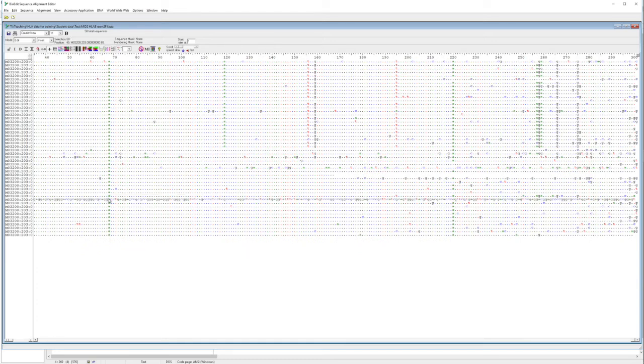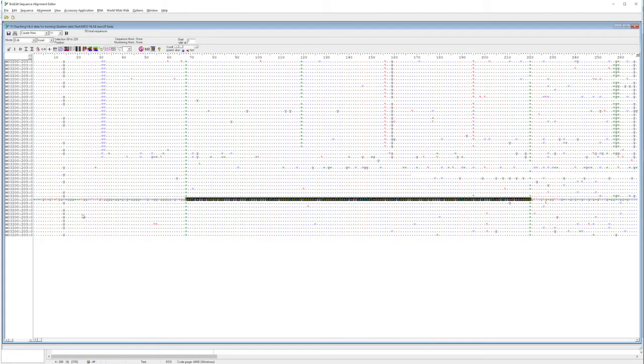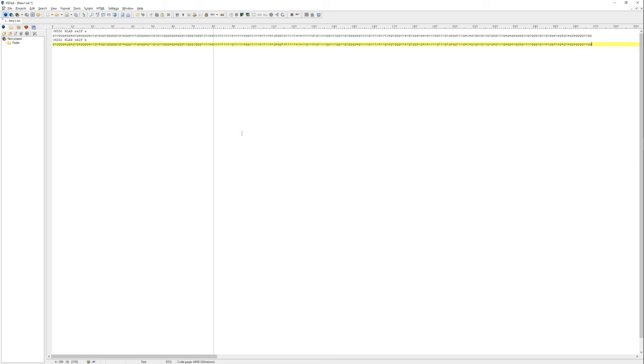So first thing we need to do is find where the errors are. So if I just copy that piece of sequence, and you see it starts about 68 bases in, but remember that we lost approximately the first 30 bases for the mid plus the primer. So basically this should be just under 40 bases in when we find this in the file. So if I just find that, okay. So you see that there is where our 2 errors are.